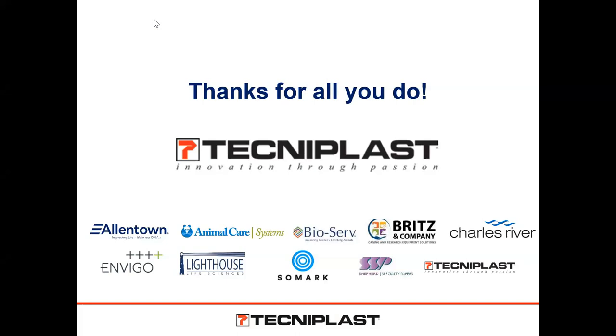Thank you. The criteria for this extended cage change really comes from the institution. We know based on some extended cage changes that if you have 1, 2, 3 animals in that cage, there are facilities that are going 30 plus days. However, we know that's a little aggressive, and maybe you don't want to go that far, but each facility probably has their own internal cage change schedule, whether it's in an SOP or not, based on two corners being wet, or maybe 3 or 4 corners, or some other combination of criteria.